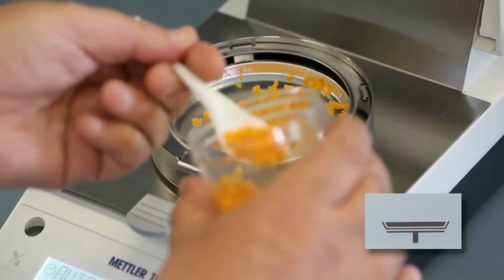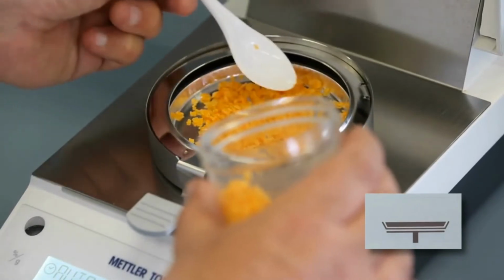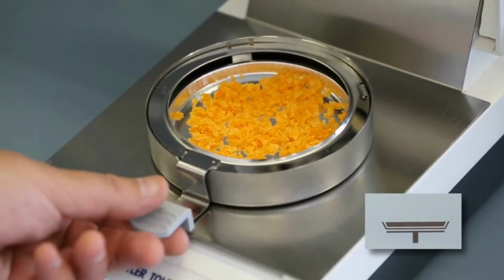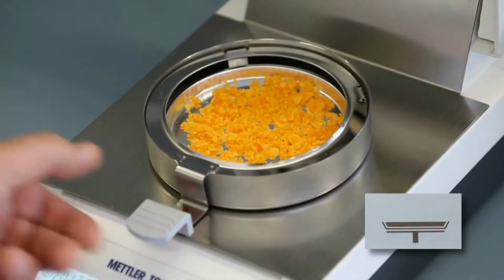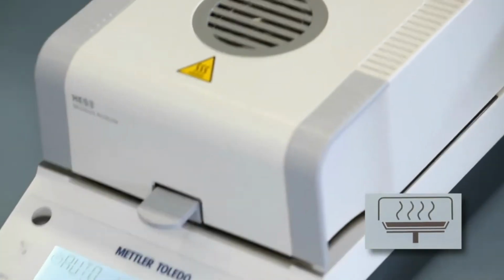Typically you would weigh in 3 to 5 grams of sample, as I'm doing now, but the amount weighed in really does depend on the type of sample you're measuring. You have to make sure that the sample is evenly spread around the aluminium sample pan. Close the lid and press start.